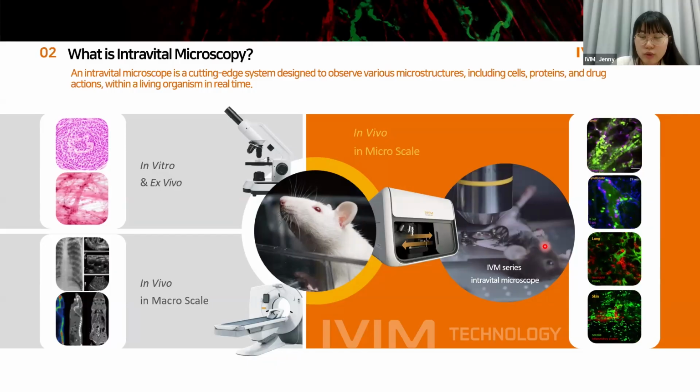So it's a very powerful tool for visualizing various biological phenomena, including drug delivery and distribution, cell-to-cell interactions, immune responses, and so on, all with high spatial and temporal resolution.